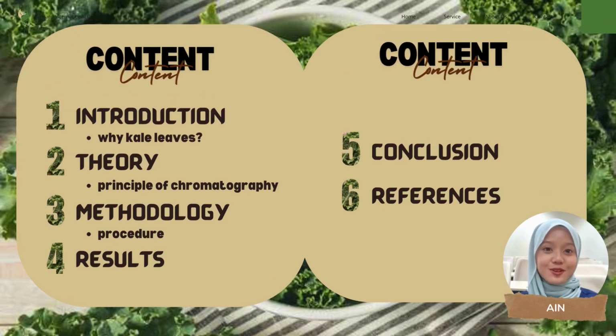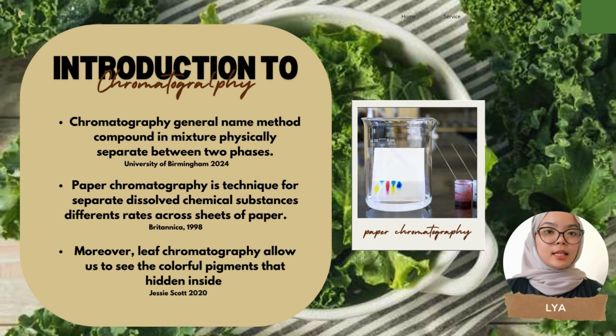Before we go further, this is the content of chromatography of kale. The first one is introduction, followed by theory, methodology, results, conclusion, and reference. So here is the introduction of chromatography.